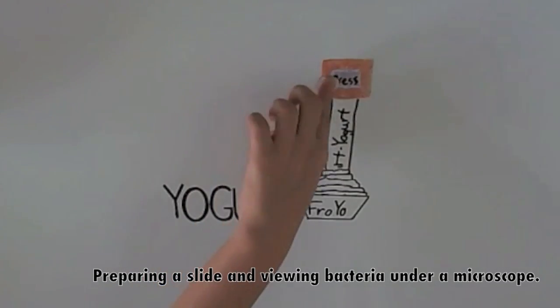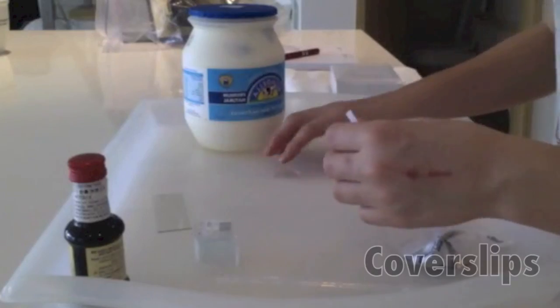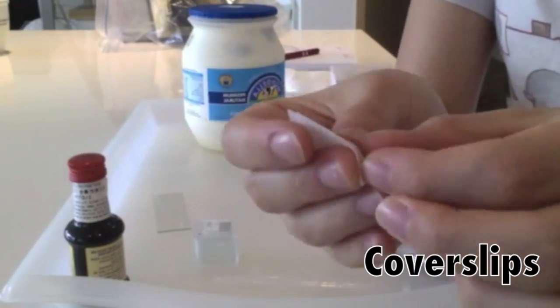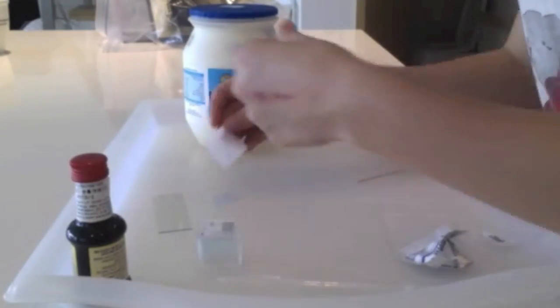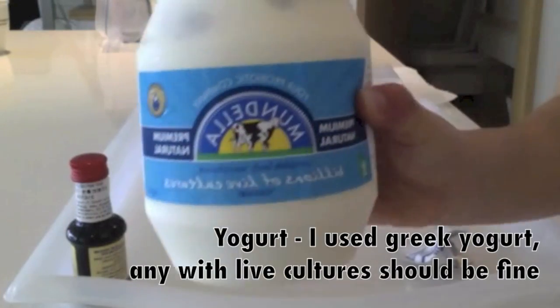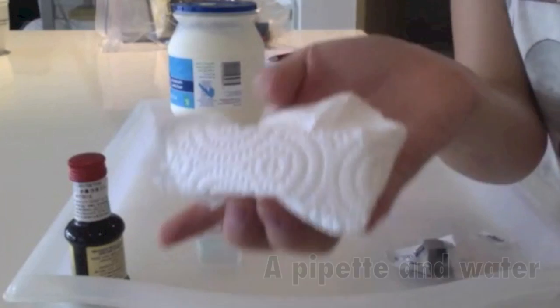Yogurt. These are some of the materials you will need to do this experiment. You will need microscope slides, cover slips — clean all slides and cover slips to avoid dust — a toothpick or other swab, and yogurt, a pipette and a few drops of water.